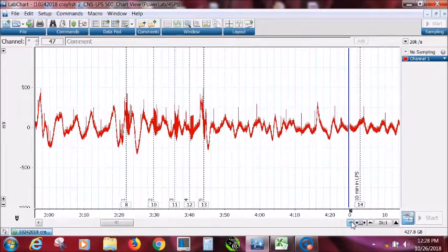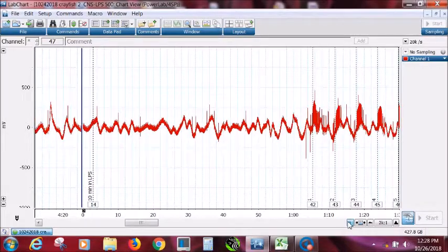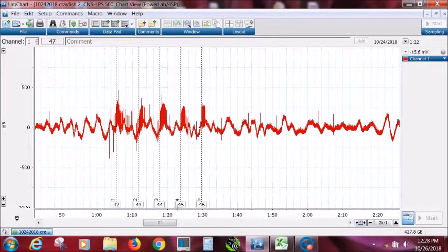And then we waited 10 minutes with the LPS sitting in the bath, and we swished it around before letting it sit. And then we did 5 more runs, and so you see 5 more. 1, 2, 3, 4, 5. And sometimes there might be extra little markers here with a comment.